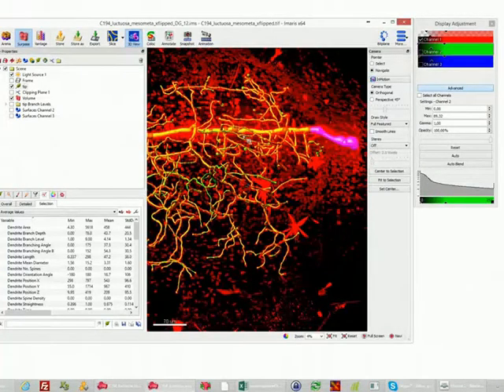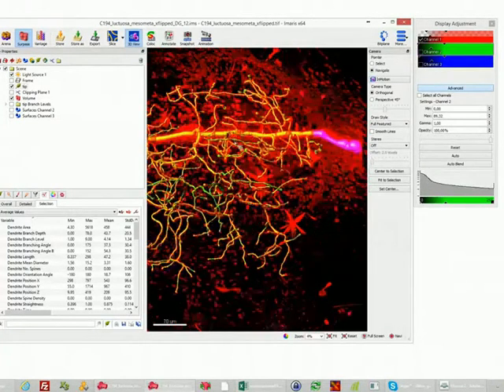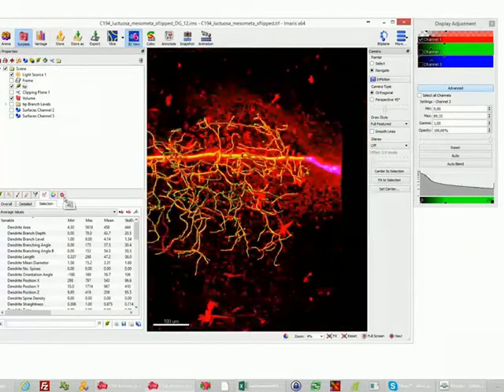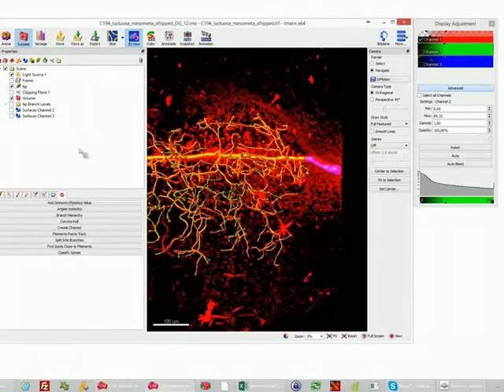The software is able to calculate this by using a little extension. On the Tools tab of the filament tracer, you will see Matlab programs. You can also add your own programs, written in Matlab, Python, or Java, for instance. These are programs which are delivered with Imaris.